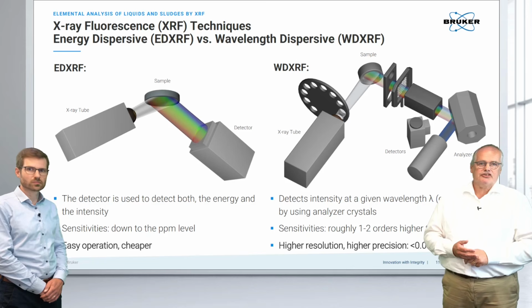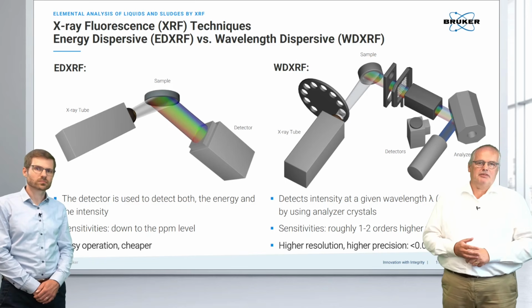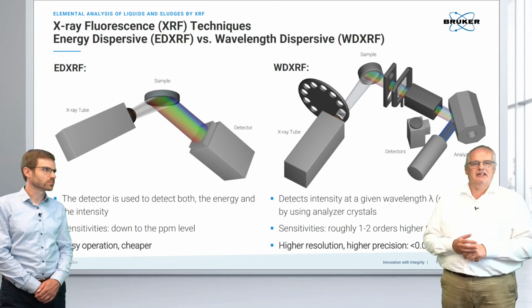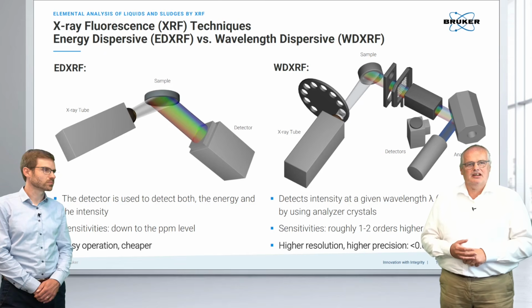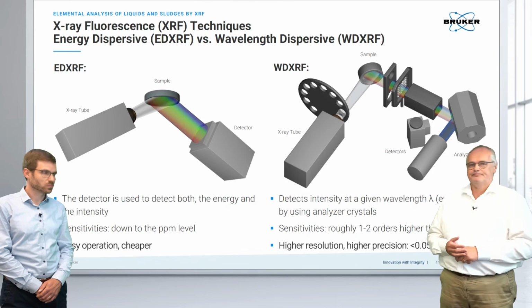The big advantage is we are collecting more photons, which end up in better counting statistics. So we typically have lower LODs or better analytical precision. And because of using a crystal, we are achieving higher resolution.